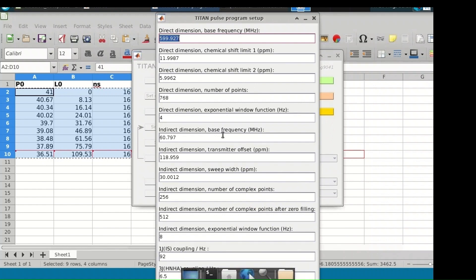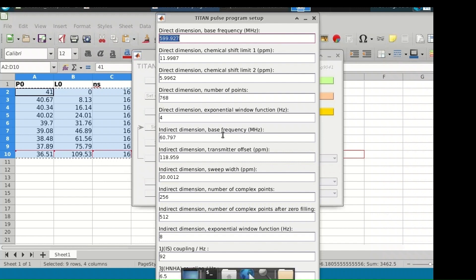Now we need to specify the acquisition and processing parameters such as spectrometer frequency, frequency offset, spectrum width, the number of points in each dimension, and the exponential line broadening applied during processing. 95% of the time the automatic data from NMR pipe input is fine; otherwise you may need to edit. Scalar coupling constants must be edited — for fully protonated spin systems, an approximate value of 6.5 Hz is used, however if the protein is perdeuterated this should be set to zero. For heteronuclear scalar coupling, 92 Hz is an appropriate value.